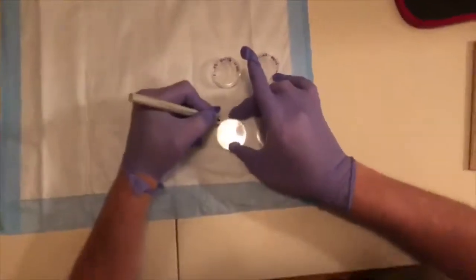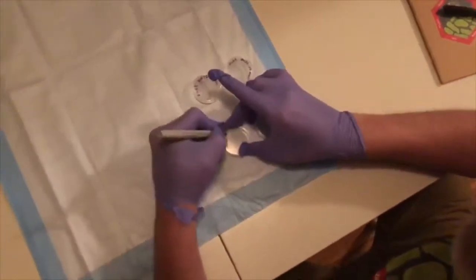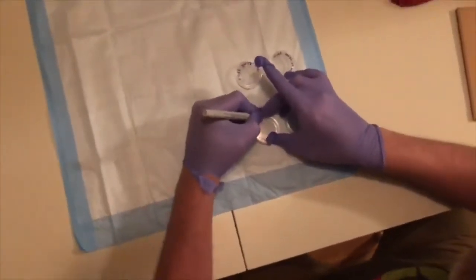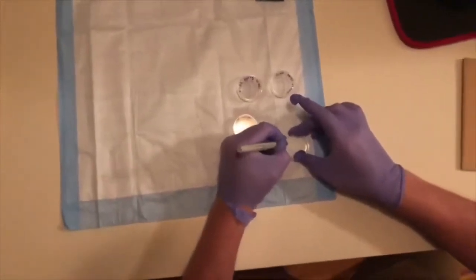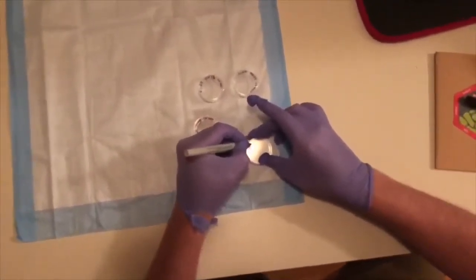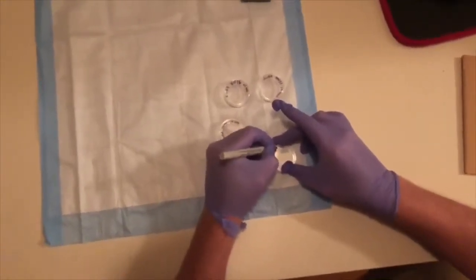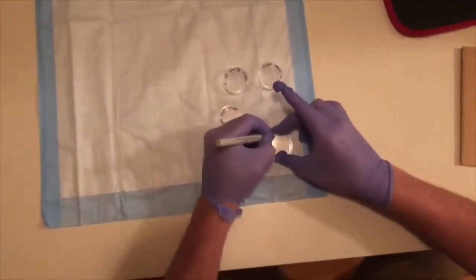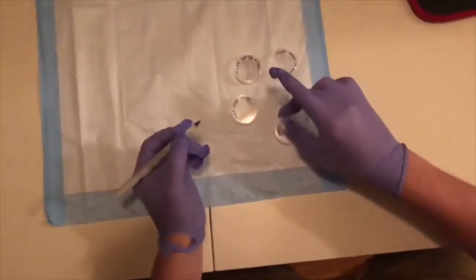EL6R, MW01, 12 August. And then this one is going to be EL6C for control, MW01, 12 August. All right, so it's pretty simple.